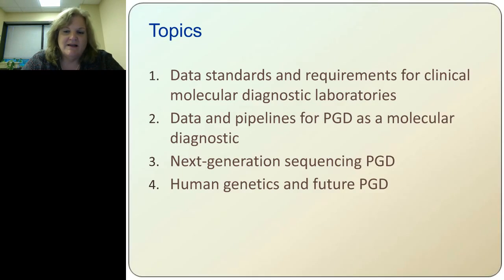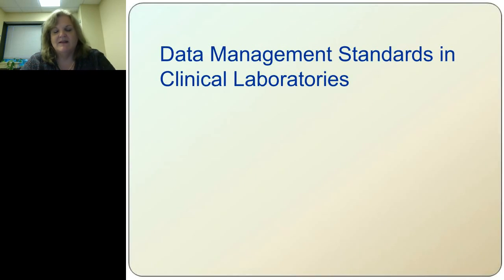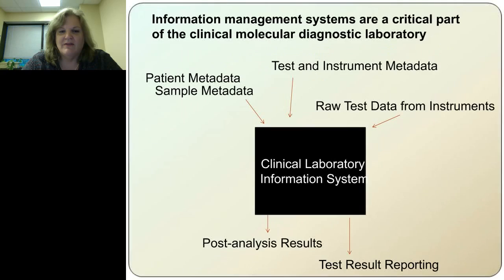And each of these, the last topic will be a little bit more speculative and a little bit more about human genetics. And for the first few topics, we'll talk about how data is handled in clinical laboratories. So, data management standards in clinical laboratories.